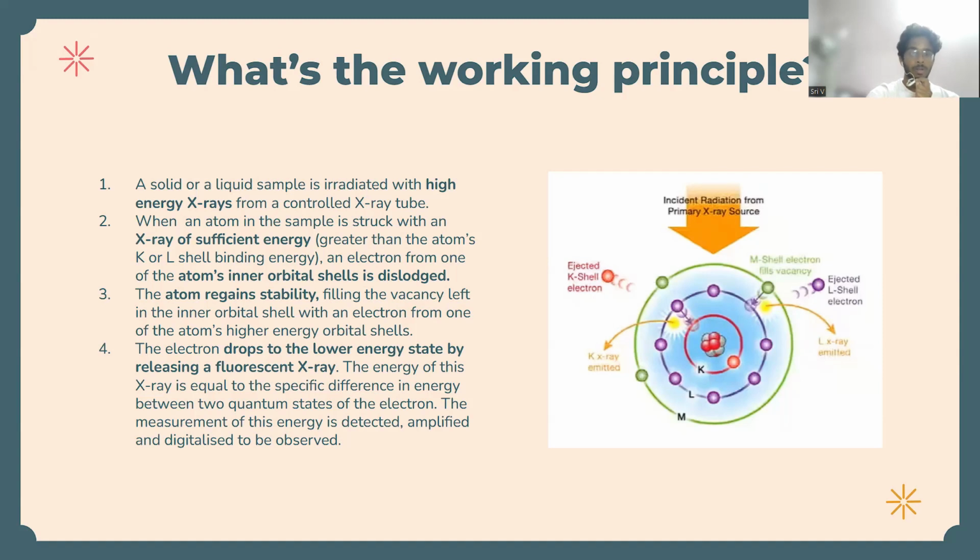The spectrum is a graphical representation of X-ray intensity peaks as a function of energy. The peak energy identifies the element and the peak height or intensity is generally indicative of its respective concentration.